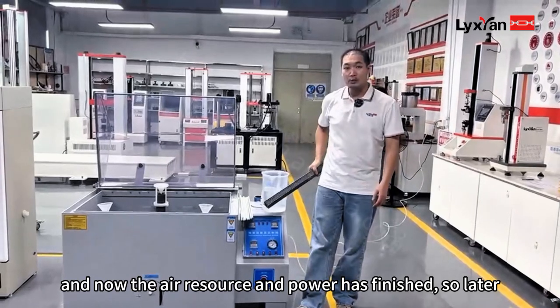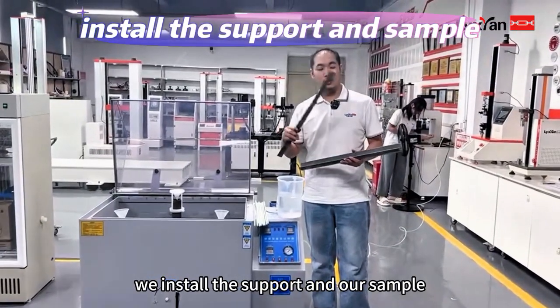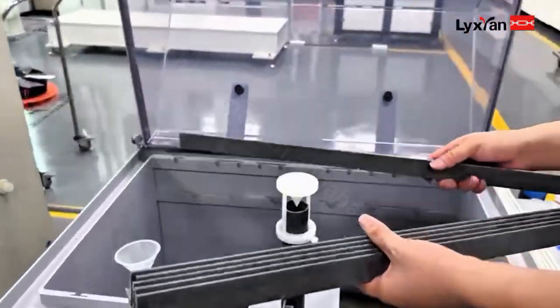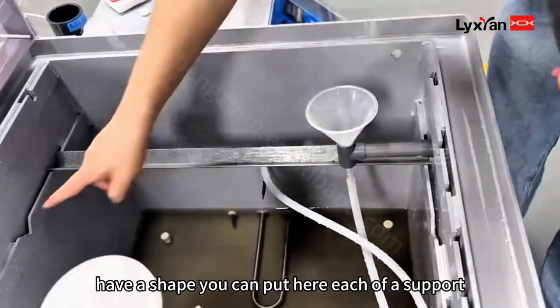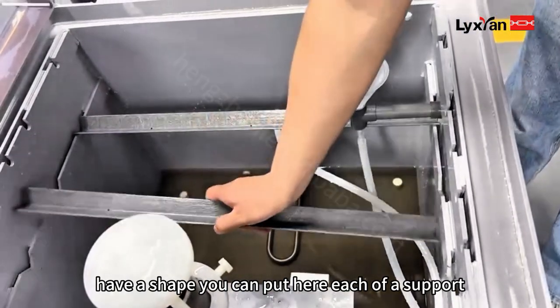Now the air resource and power connections are finished. Next we install the support and our sample. Place the V-support in the bottom. Here we have a shelf where you can put each support — the V-support.